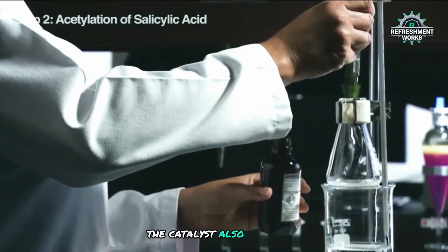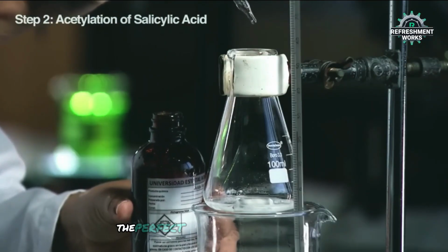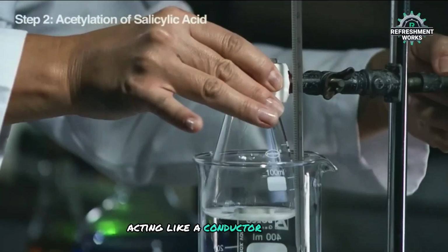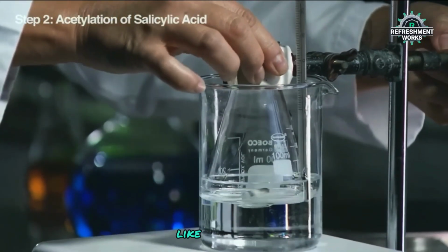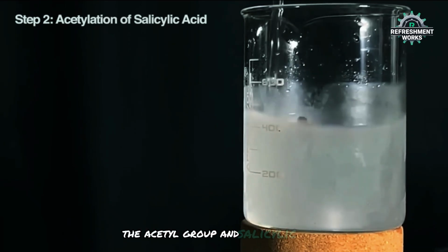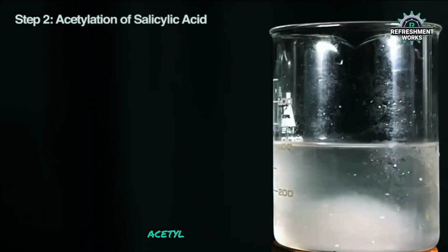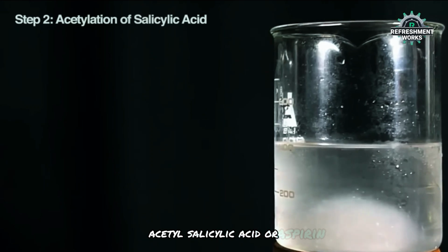The catalyst also joins the mix. It creates the perfect environment for the reaction to take place, acting like a conductor directing the action. Like two old friends, the acetyl group and salicylic acid bond. They form a new compound, acetyl salicylic acid, or aspirin. But it doesn't end here, alright?